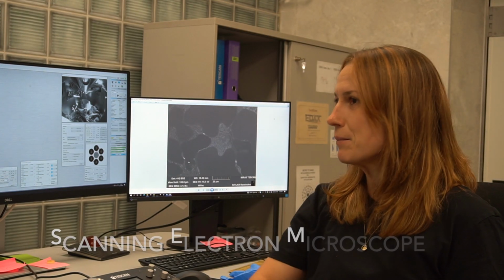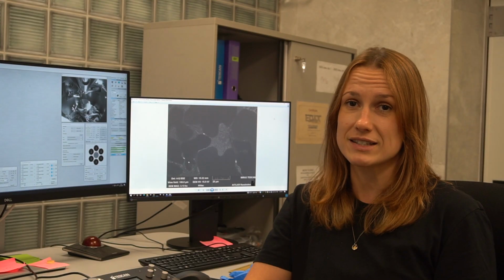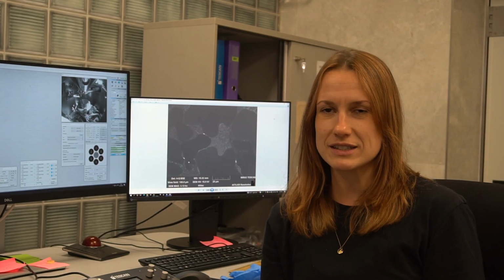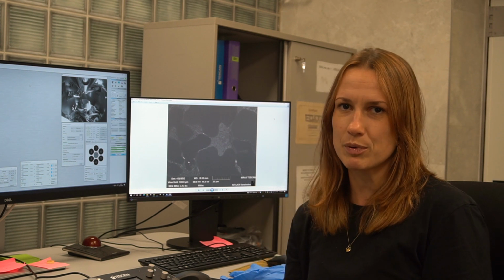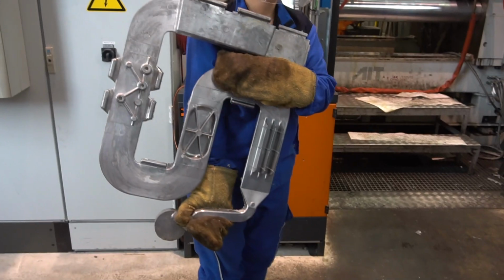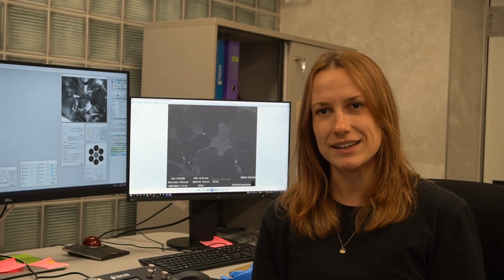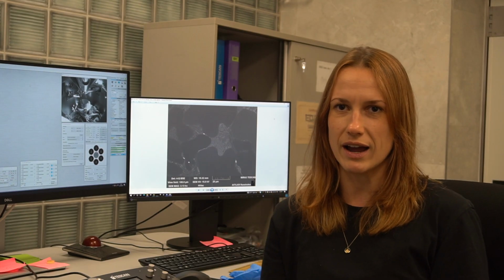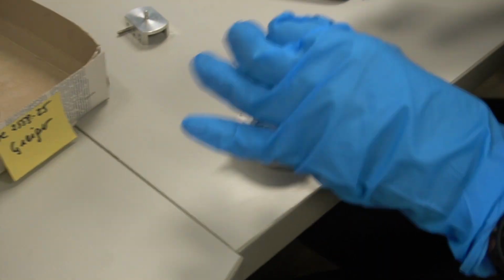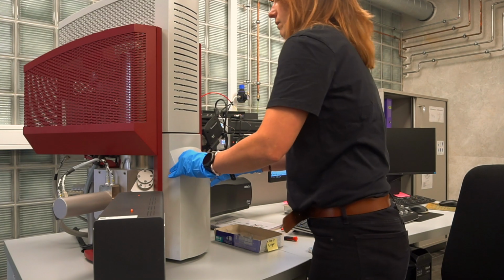We are in front of the SEM here, which is a major tool to characterize alloys. And so in the whole loop of characterization, we have the processing step. So here that would be high pressure die casting, HPDC. And when we come up with an alloy that has passed all the tests, so I think it's worthy to be produced via high pressure die casting, we have the cast parts, do some metallographic preparation, and then we have a look at it under the SEM.